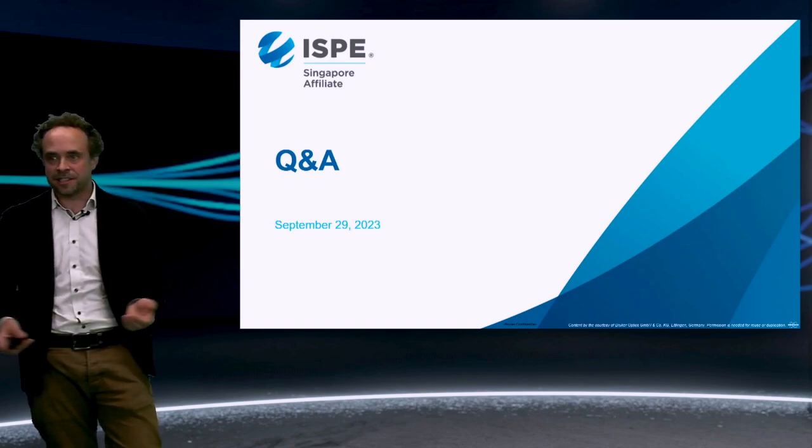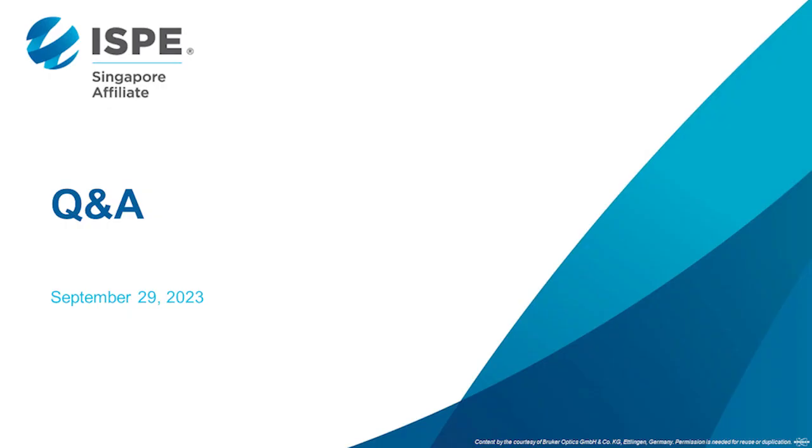And let's open the Q&A session. Right. We have the 2 questions. I will just have a look at them and read them. Yeah, actually, I can read them. So one of the questions is, what algorithm is used for comparing two spectra? So I think the question is directed at Mario for his quality control.